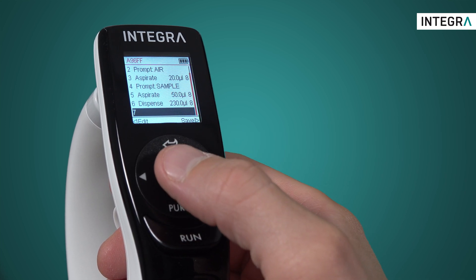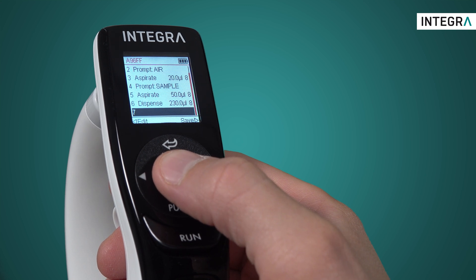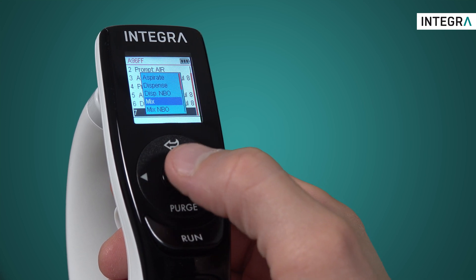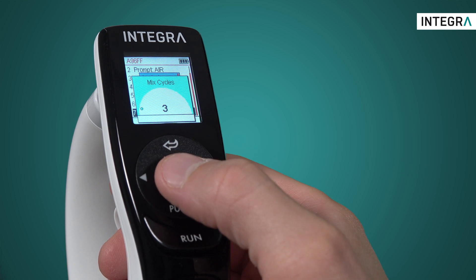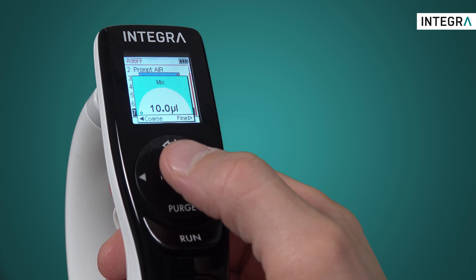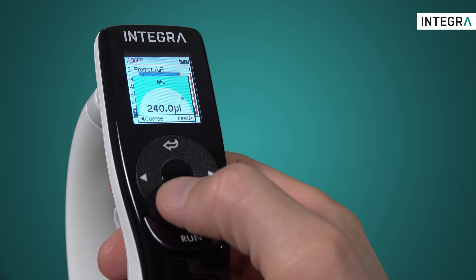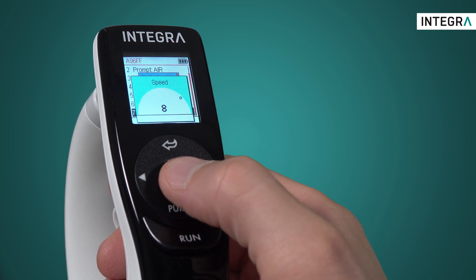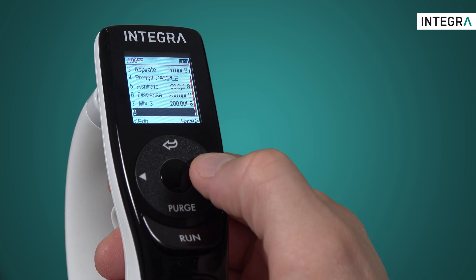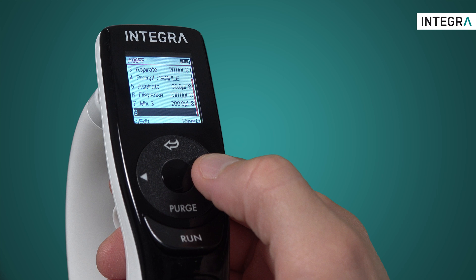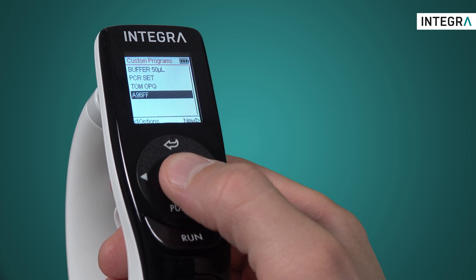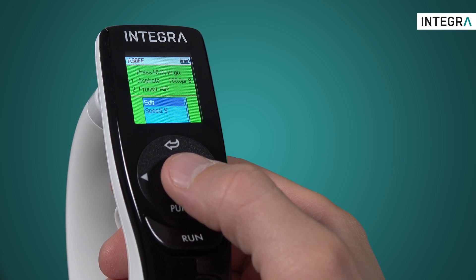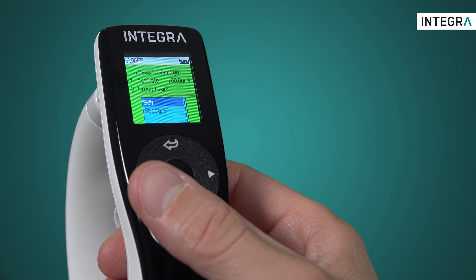And all that remains is the mix step to get a homogenous solution, so we'll add that now: Mix 3 times 200. And that's it. The program is finished and saved. All we have to do now is enter it to start, and the screen will show us always what the next step is.